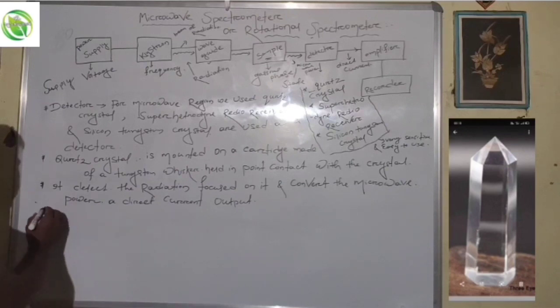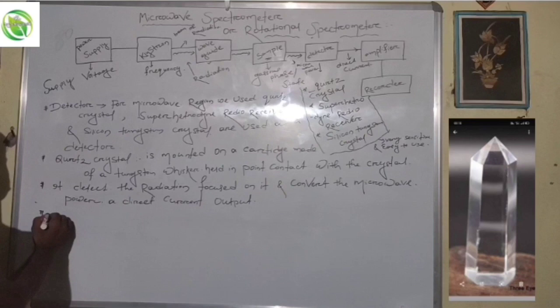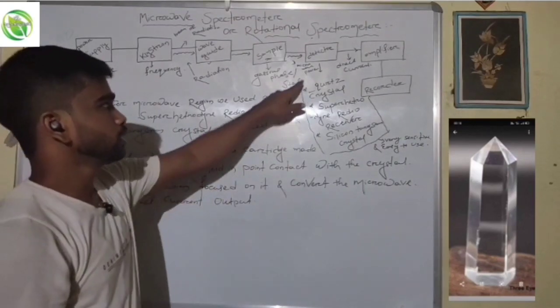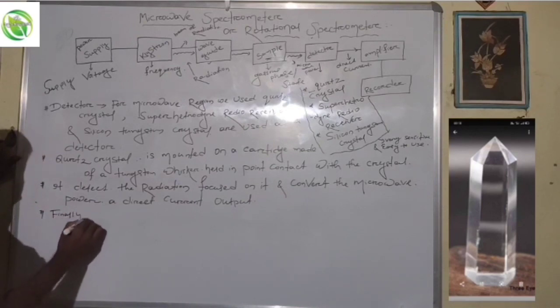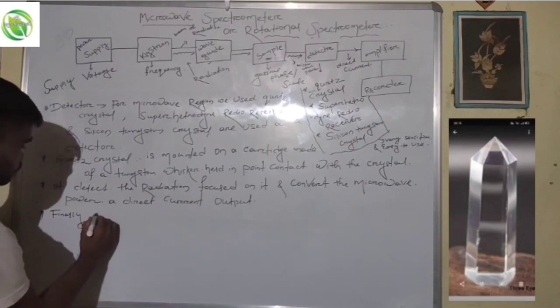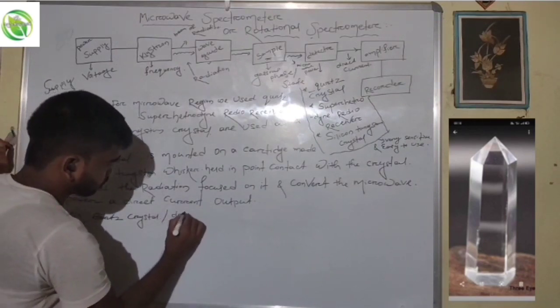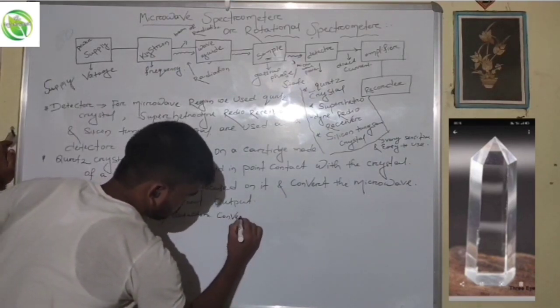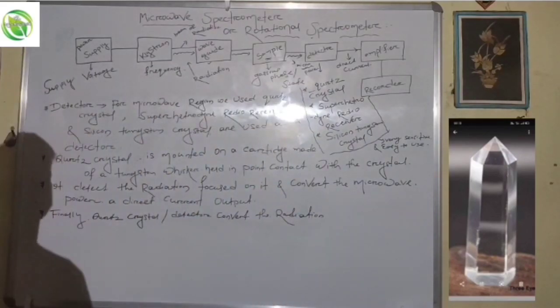So, the quartz crystal is used in a detector. It is easy to use and very sensitive. Finally, the quartz crystal detector converts the radiation into an electrical signal.